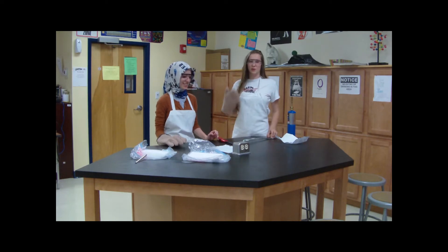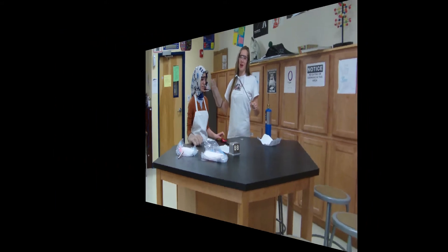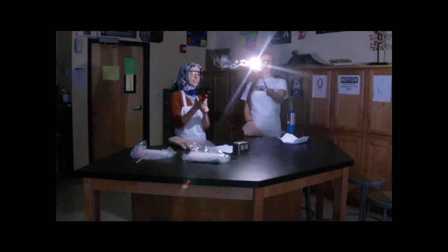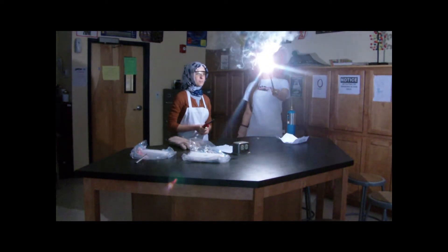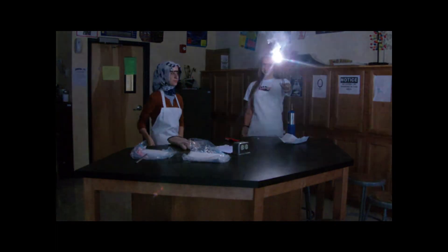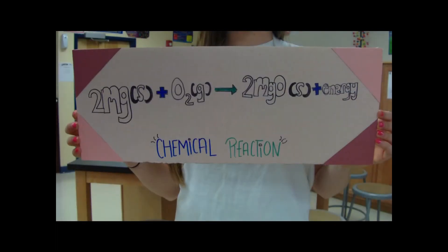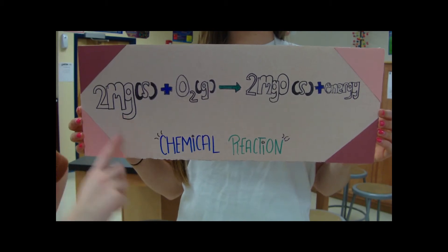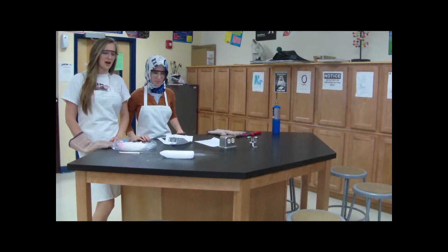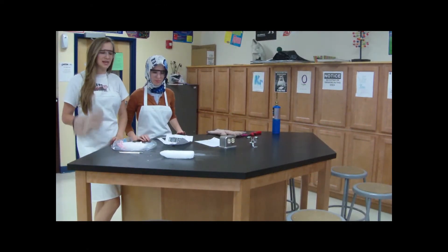Alright, before we start the actual experiment, we want to show you what burning magnesium actually looks like in the air. The chemical reaction you just saw was magnesium with oxygen, which forms magnesium oxide. Now that you've seen what magnesium looks like when it burns in the air, we're going to show you what it looks like when it burns in dry ice.